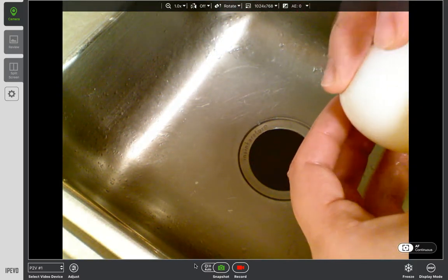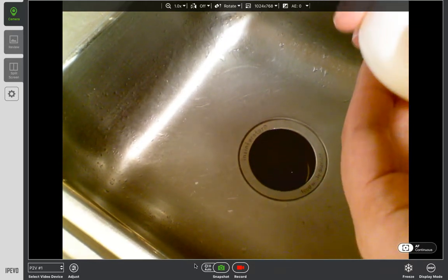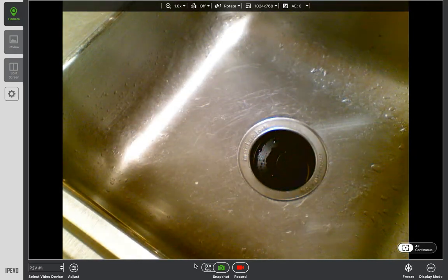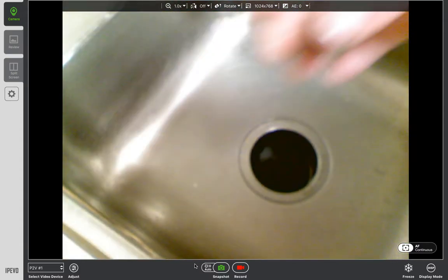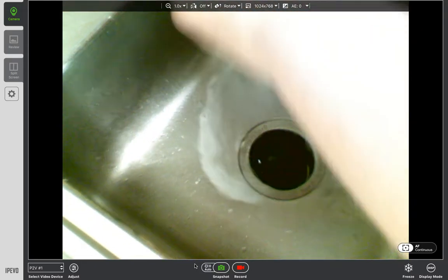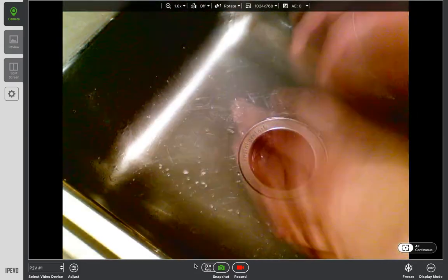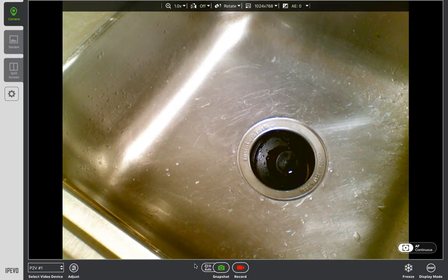Now, in osmosis today, we're going to be learning that osmosis is when water or a liquid passes through a membrane. Here's our membrane, right? Oh my gosh, you guys have aha moments going all over the place. Maybe, maybe not. I'm going to set this down because I'm going to wash off my hands a little bit, and then let's write down some of our findings here. And then we're going to weigh our egg, and we might be surprised. I just said we got rid of the shell. So do you think this is going to be lighter, or do you think this is going to be heavier? Don't write it down yet. We'll actually use our math.